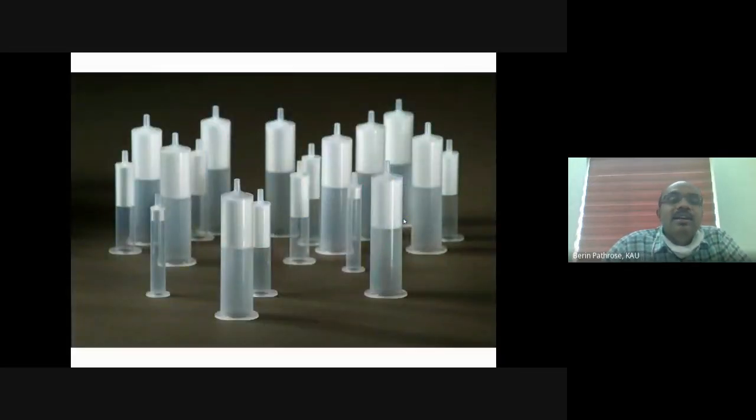So this is how a cartridge looks. That's why I told you it looks like a syringe.